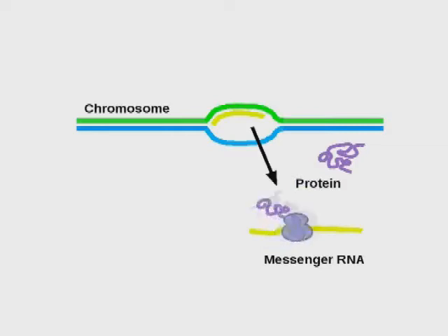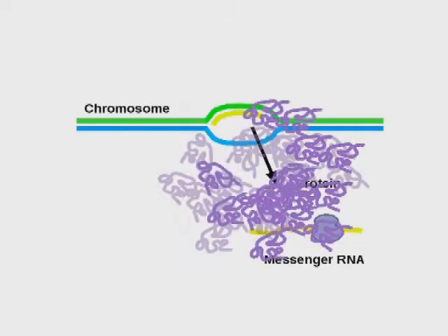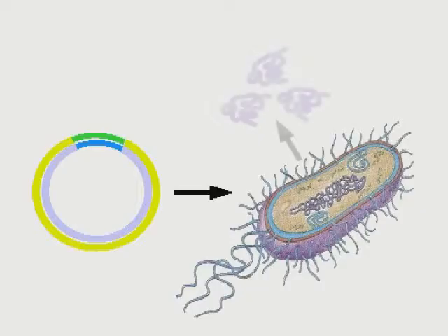The amount of a given molecule found within a cell is often very small. Therefore, to enable us to study our molecule, it is, in general, necessary to manufacture it in a large quantity. To do this, we clone the gene of our protein of interest into bacteria to permit its production or expression in massive quantities. This pair of strands represents a section of the chromosome. The yellow box on the chromosome symbolizes the gene for the protein of interest.